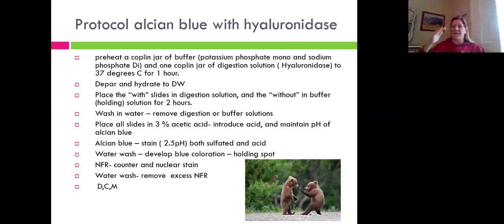You have latitude. You don't have to go on a countdown. You have leeway. If you're across the room and your timer goes off, it's okay. Just walk over and pull your slide. It's not a do or die type thing.